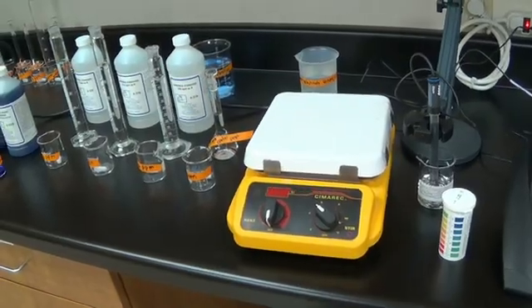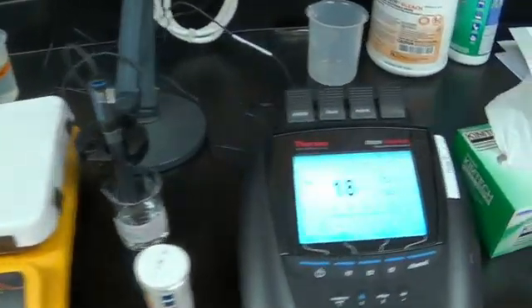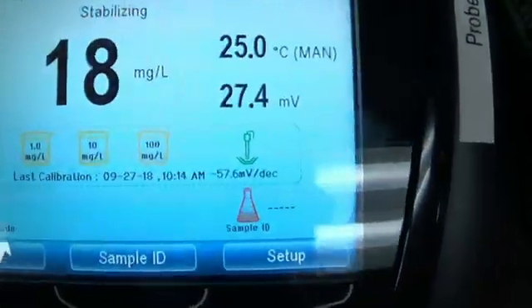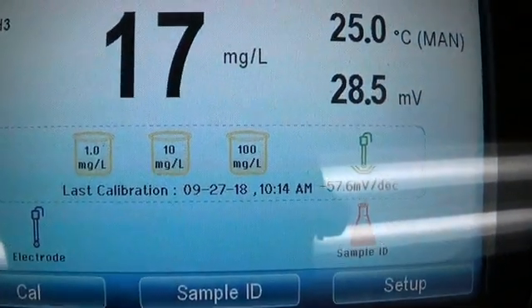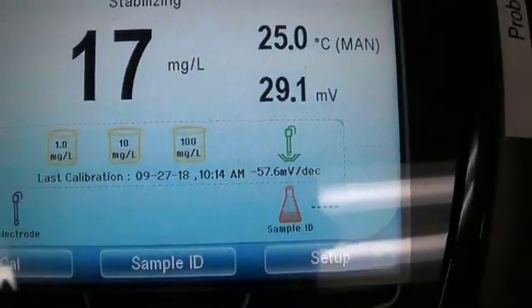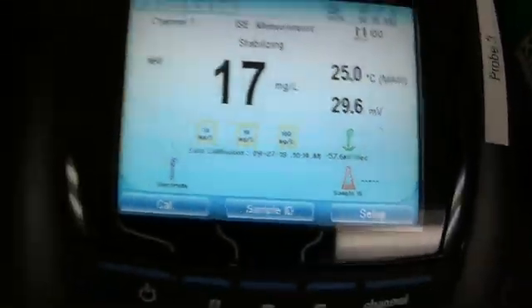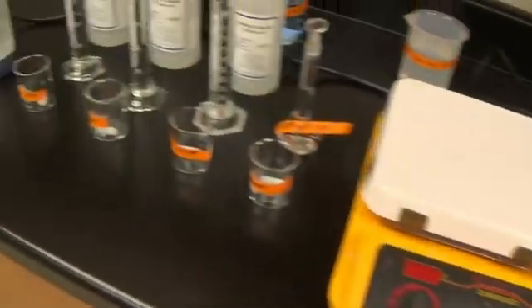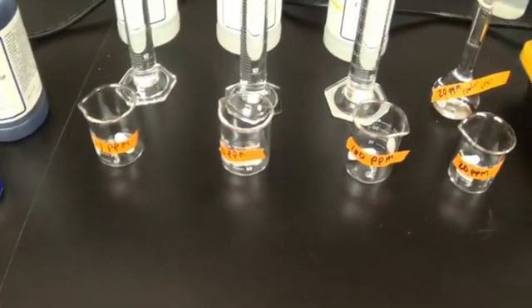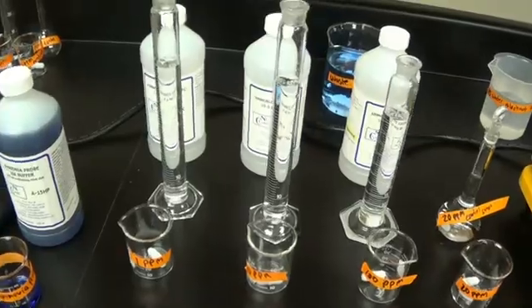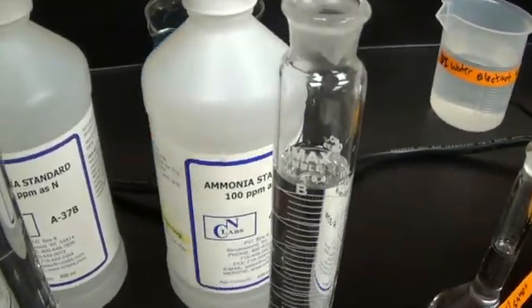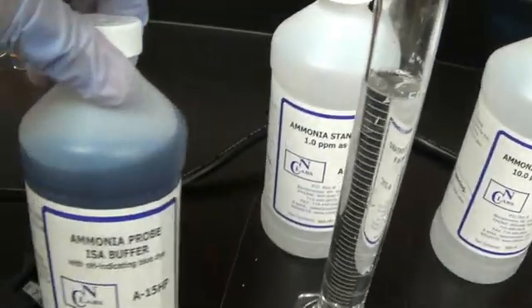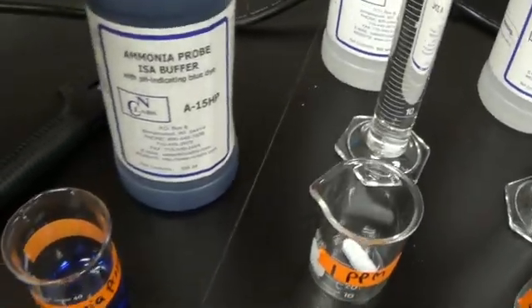Alright, I am going to now calibrate for ammonia. And I'm going to do the higher level of ammonia. I'm going to use a 1 ppm, 10 ppm, and a 100 ppm to calibrate. So I have my beakers ready and my standards ready. My 1, my 10, and my 100. I have my ISA poured off into a small beaker.